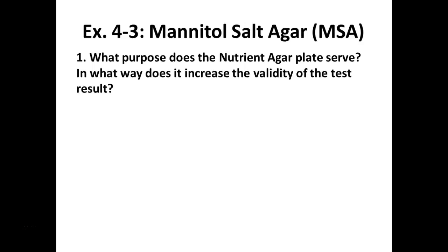So most of you, it didn't grow, right? Well, does that mean your organism was dead? No, it means the salt killed it. It's not salt tolerant, right? Can we ask the second question about your organism? Can we ask if it ferments mannitol? No, because it died, right? So it's not applicable for most of you. Mannitol fermentation, we can't tell, right?